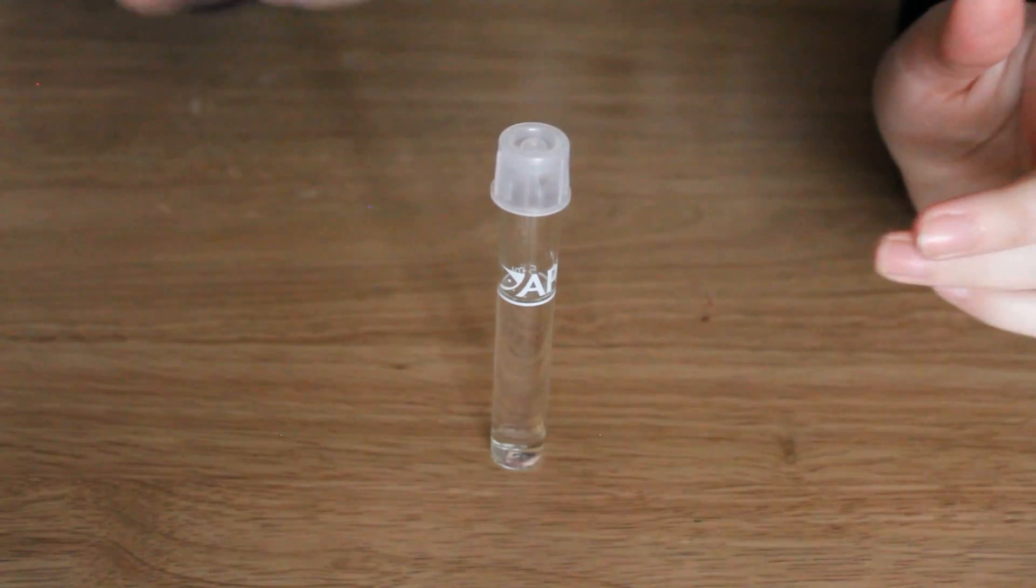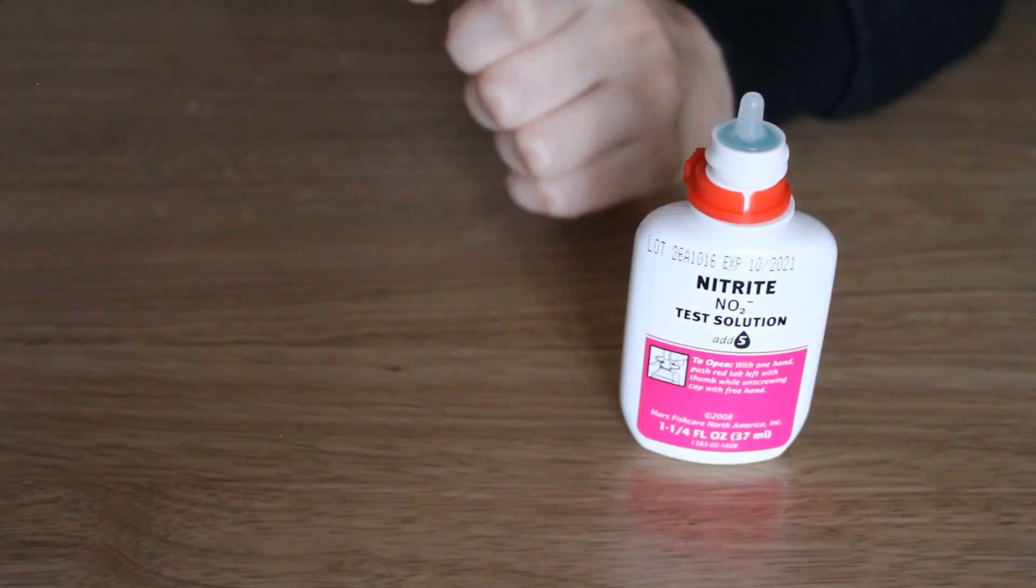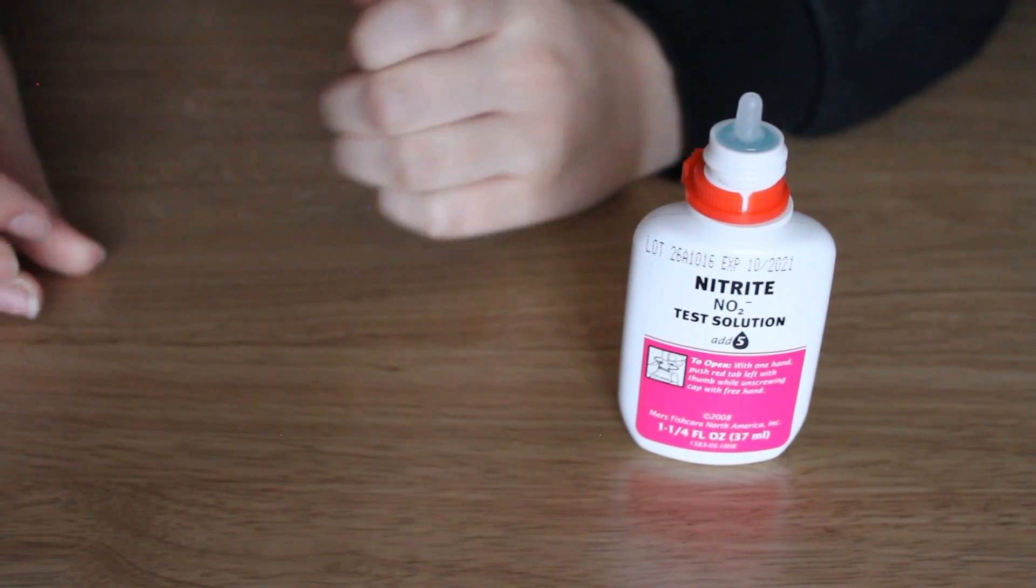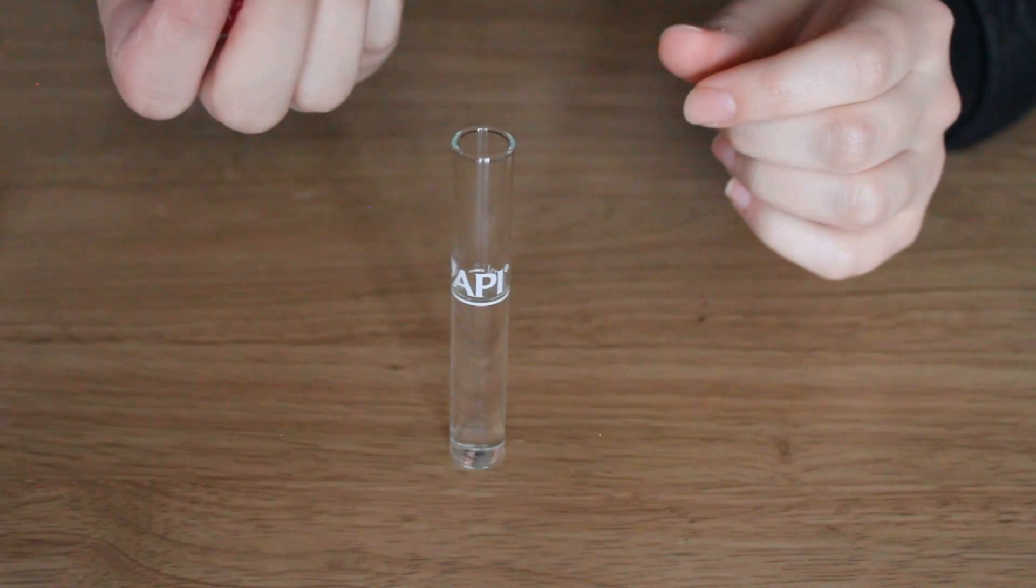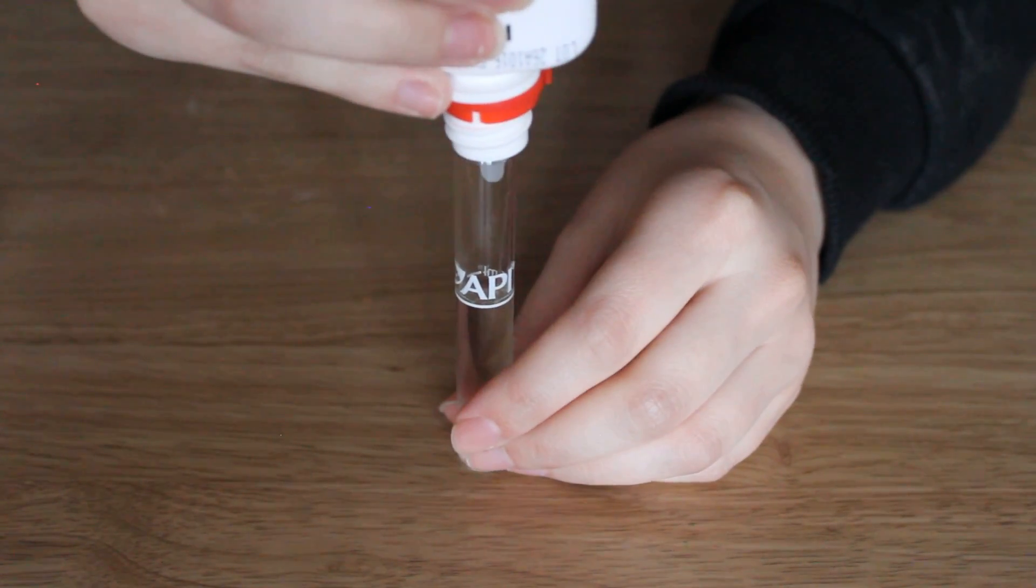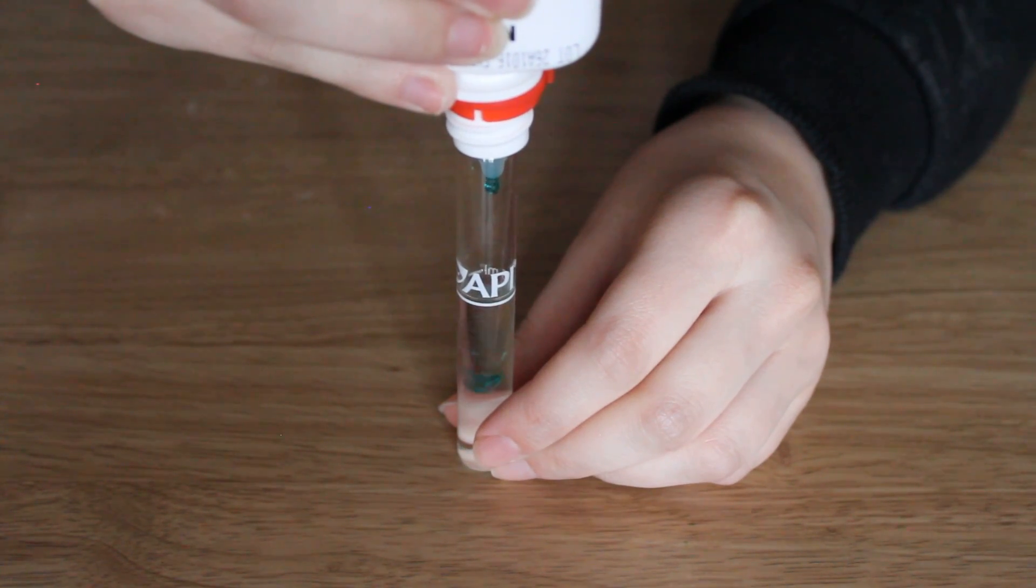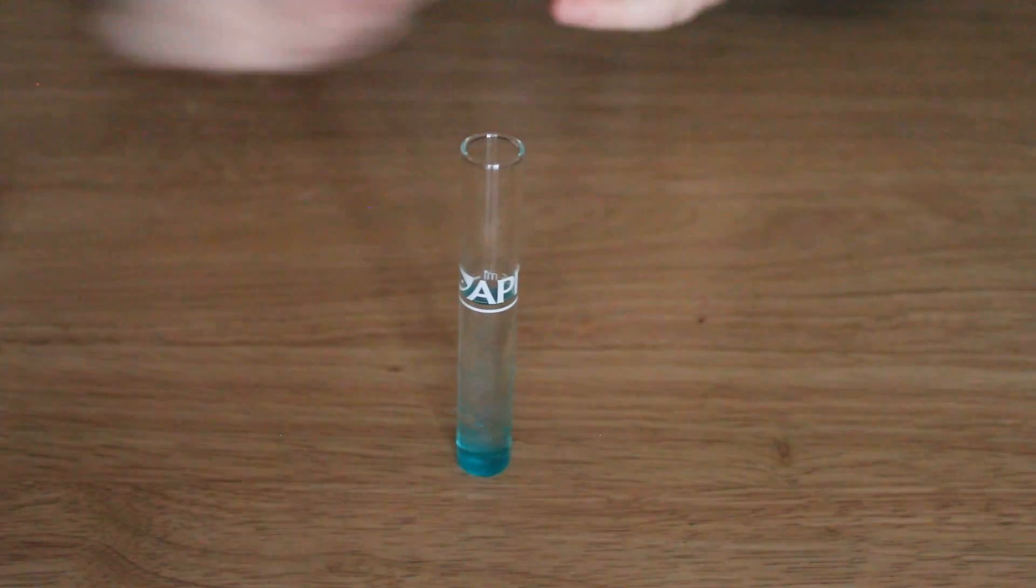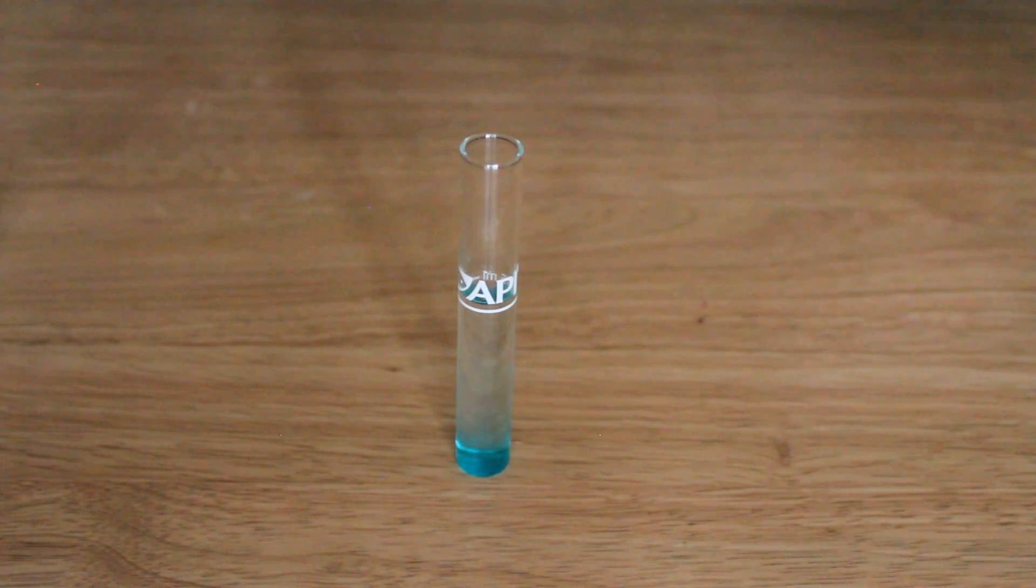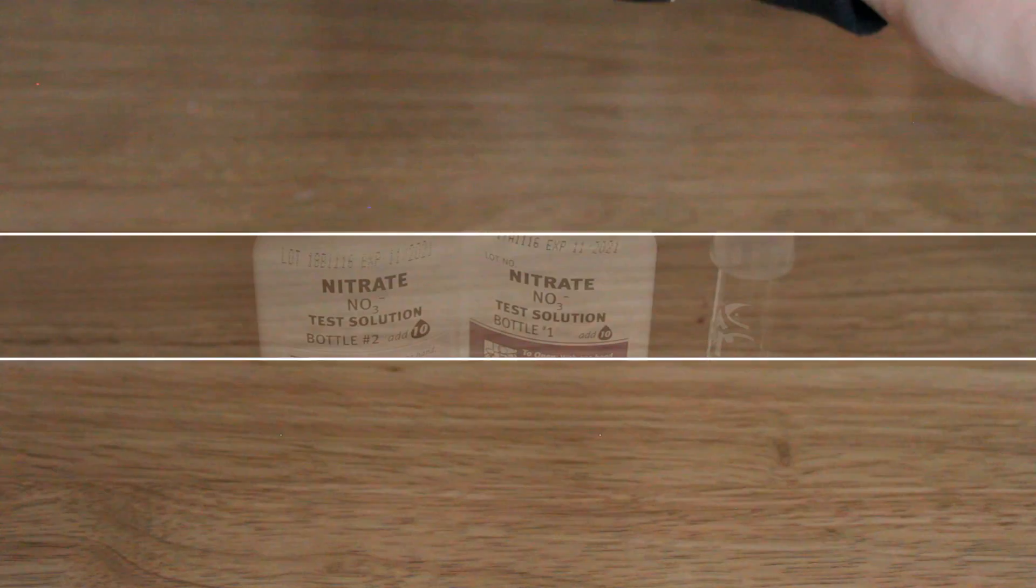Most of these bottles you need to shake before you use and we're going to add five drops of this. One, two, three, four, five. Put the lid on and then we're going to mix it up. Oh and it's leaked. We're going to just leave it to settle for a little bit.